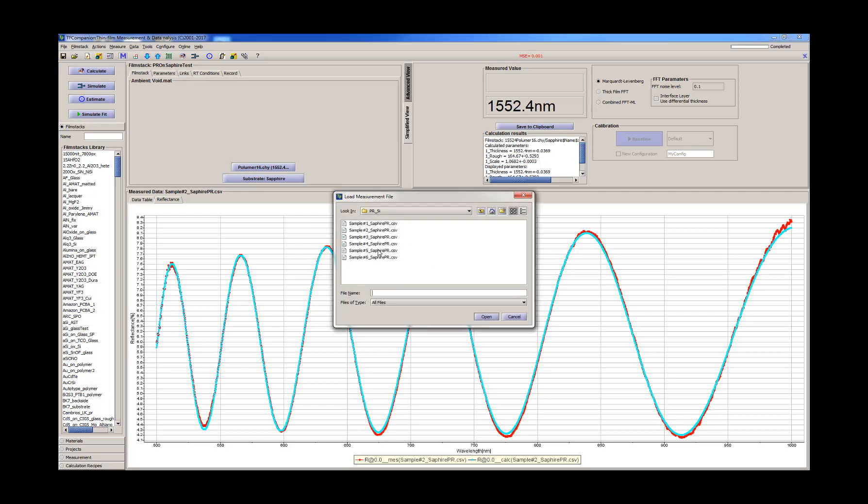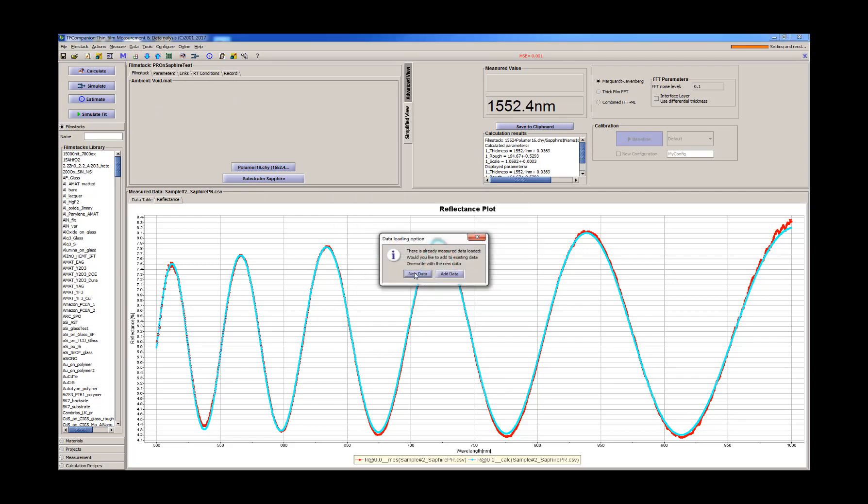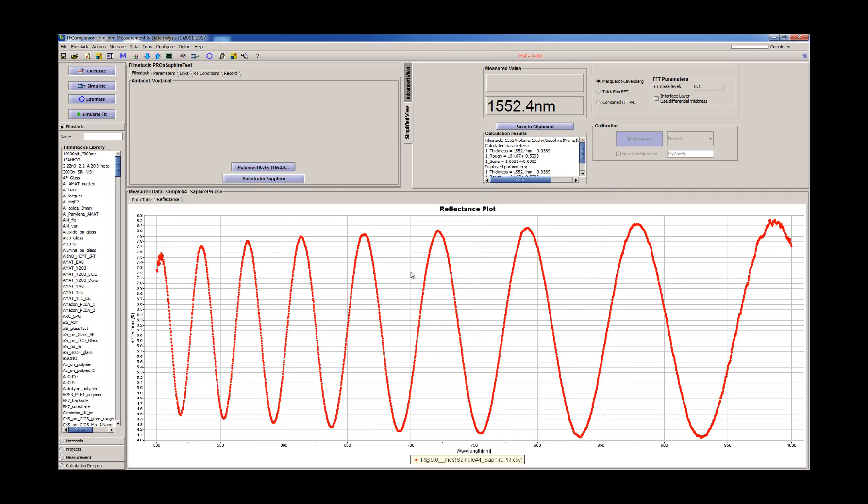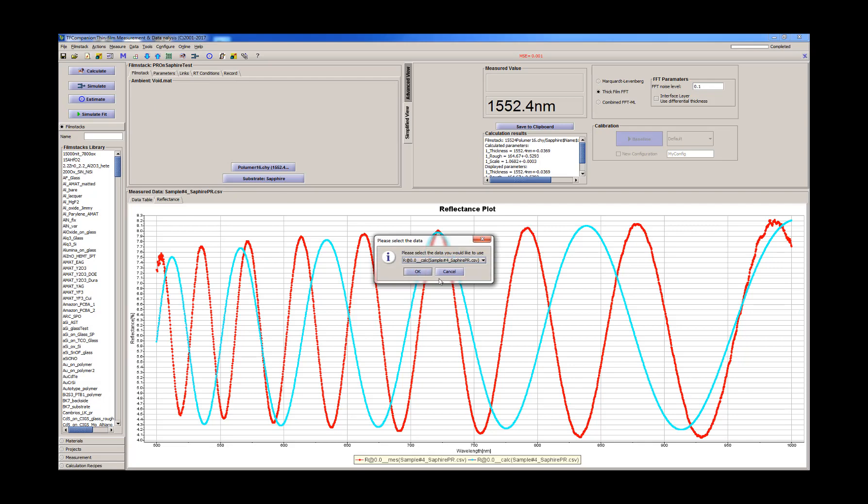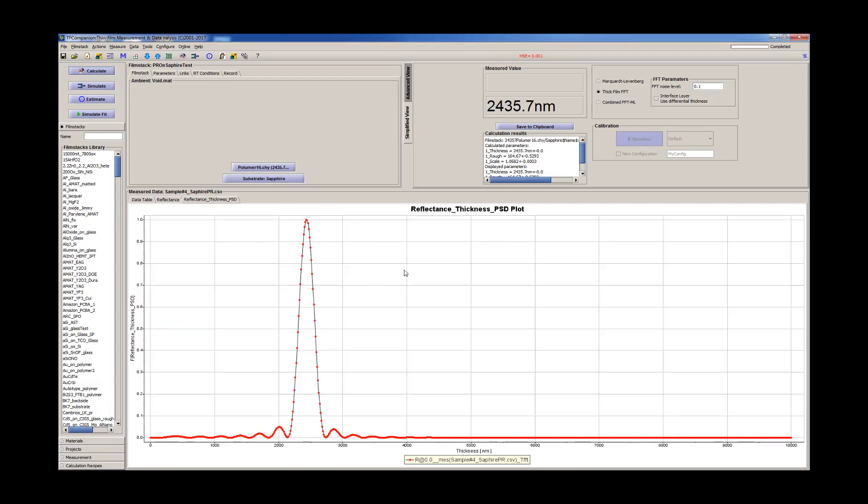And we can try the thicker photoresist. Now, obviously, that's a totally different thickness. So we have two choices. We can always use the thick film algorithm and get very nice and accurate results.